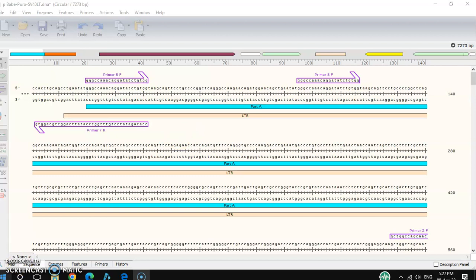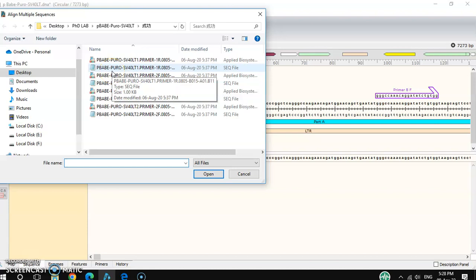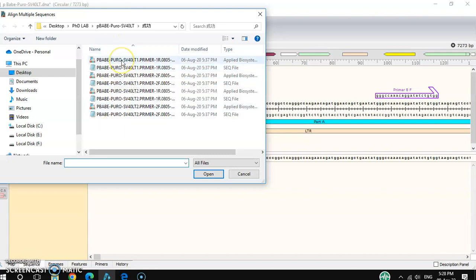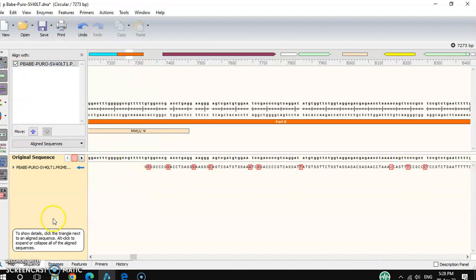I already have my SnapGene file open. Go to the left side — you can see one option here, click it and it takes you to your desired folder containing your sequencing result. You can select one file, or by pressing Control you can select multiple sequences at the same time. First I'll open this one and a pop-up window will appear.